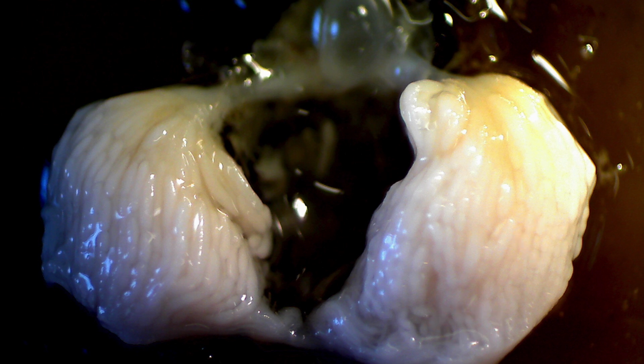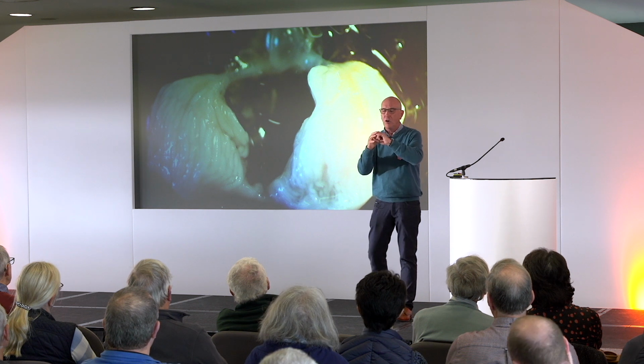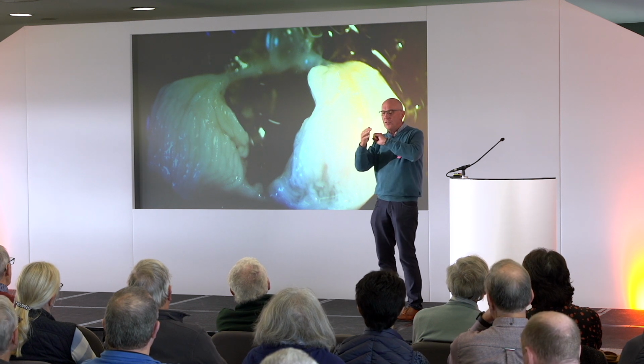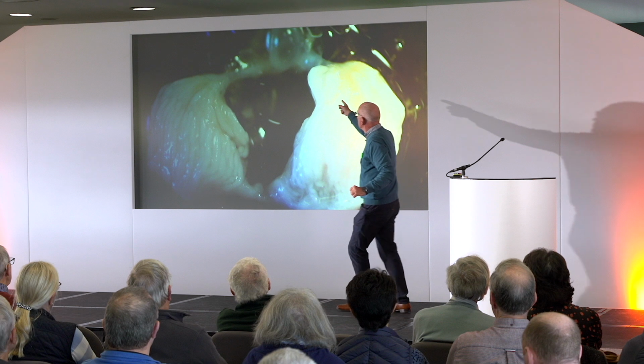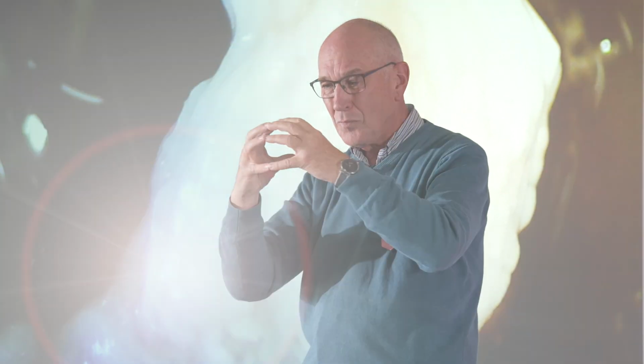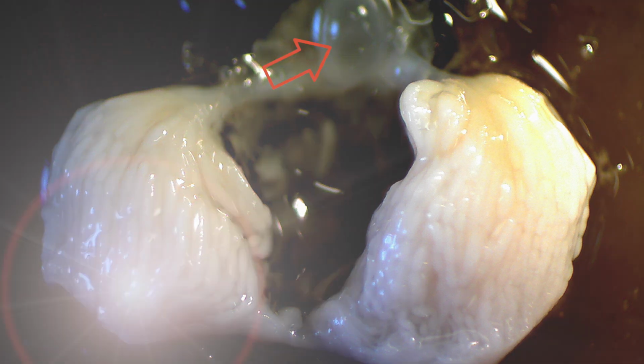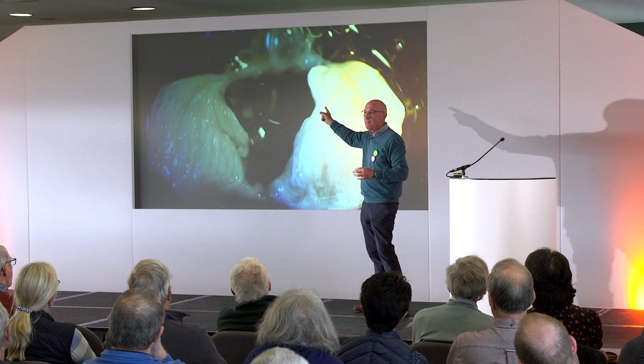and you've got the follicle cells on the outside. And then at the top, you've got the lateral oviduct. So the egg is spurted out into the lateral oviduct, and it goes down into the middle oviduct, which is here. And then you have a ball above, which is called the spermatheca. That's where the sperm is stored from a drone in the queen. If it's clear like that, it was a virgin queen. If it's opaque, it's full of sperm.